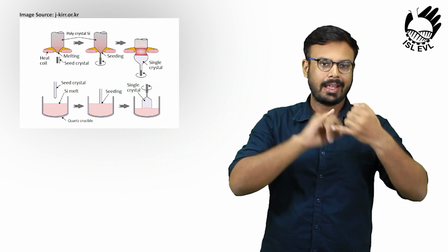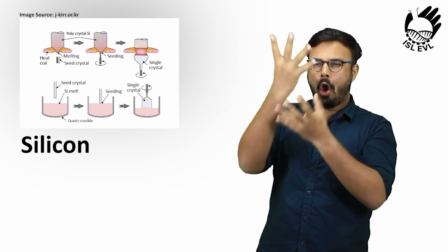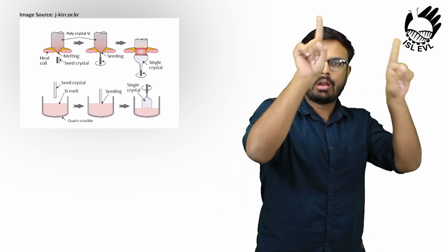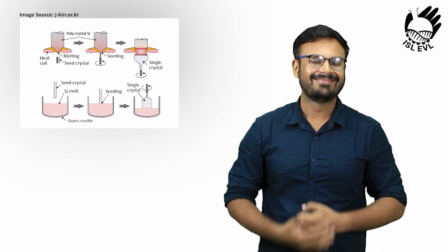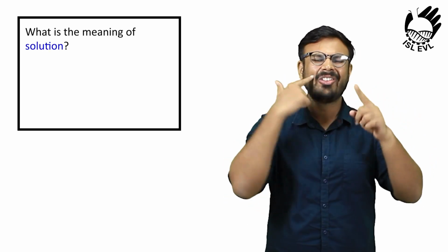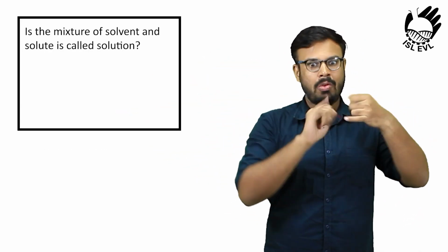crystallization is based on the principles of solubility. Compounds, called solutes, tend to be more soluble in hot liquids, solvents, than they are in cold liquids. If a saturated hot solution is allowed to cool, the portion of the solute that is no longer soluble in the solvent tends to be released from the solution and forms crystals of the pure compound. For example, we can get crystal form of salt through the crystallization process from seawater. Additionally, metals can solidify from their melted states. The electronics industry relies on growing single crystals of silicon in this way.